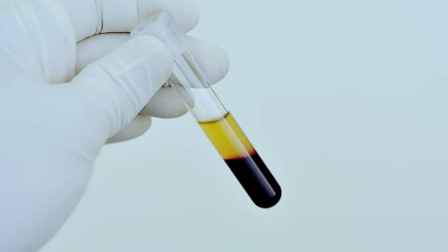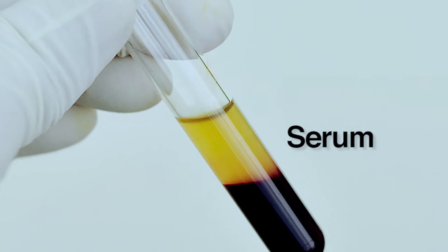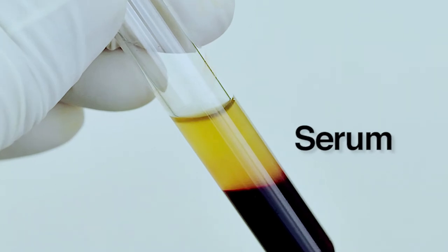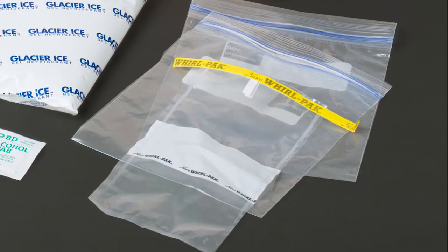There are two main components of blood: the red and white blood cells, and the clear yellow serum portion. Most antibody tests will utilize the serum component of the blood sample, so you'll want to allow the blood to clot, which separates the cells in the blood from the liquid serum. So don't use blood vials that contain an anticoagulant, such as heparin.